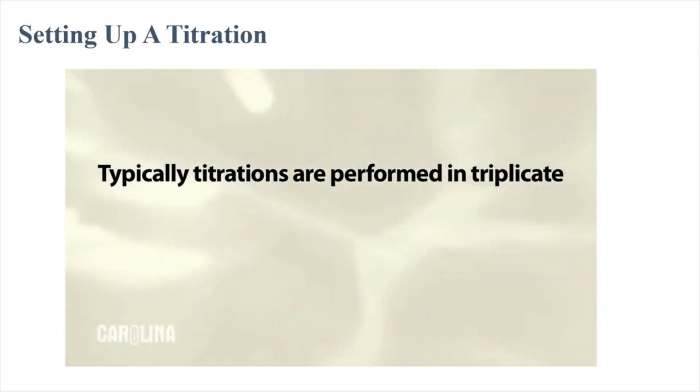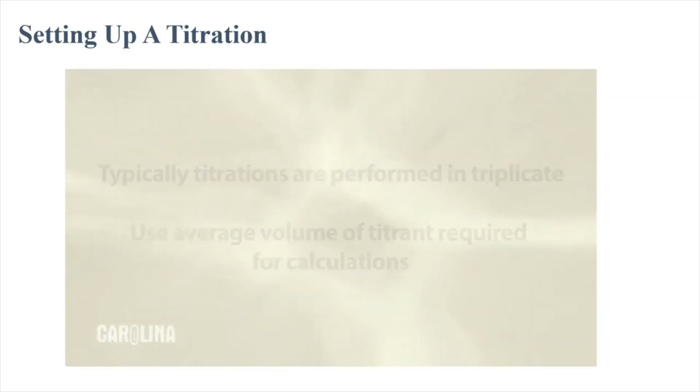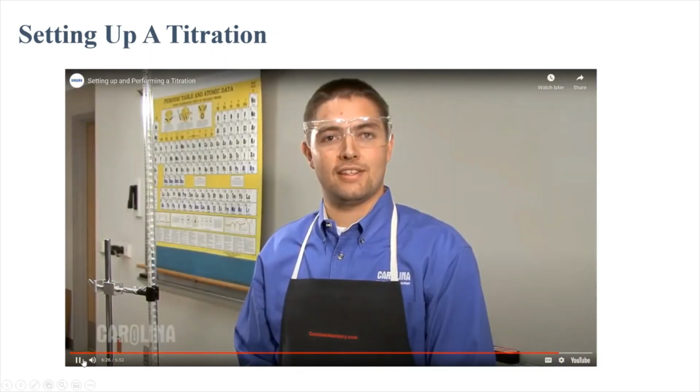Typically, titrations are performed in triplicate. Use the average volume of the titrant required to reach the endpoint for any calculations. You now know how to properly perform a titration. Be sure to check out the second video in this.